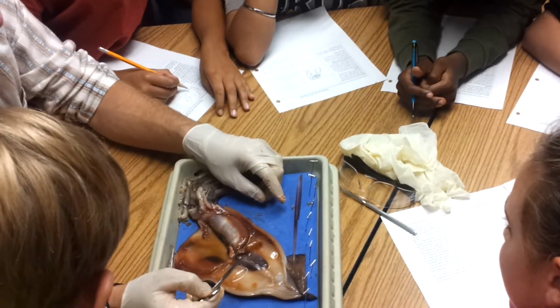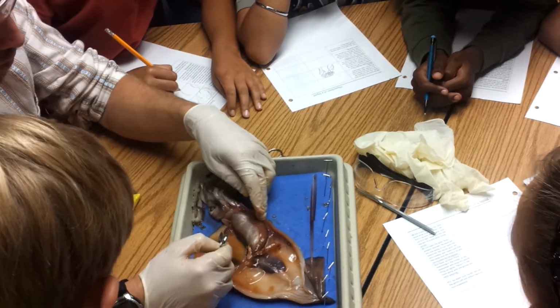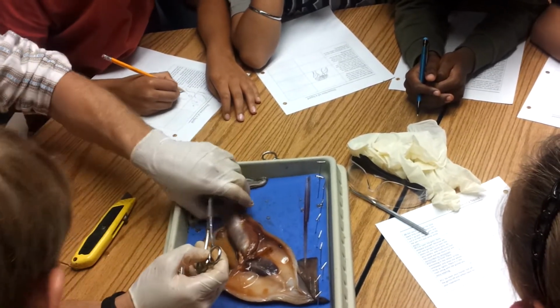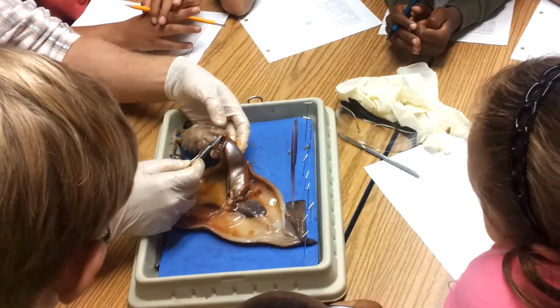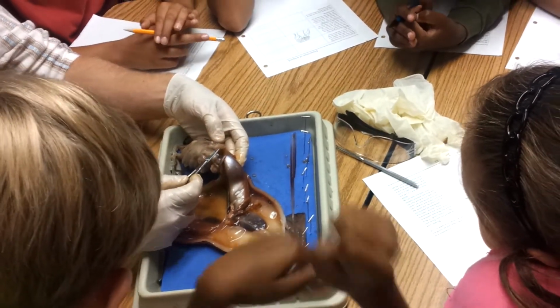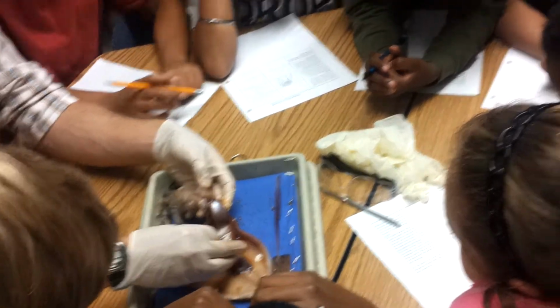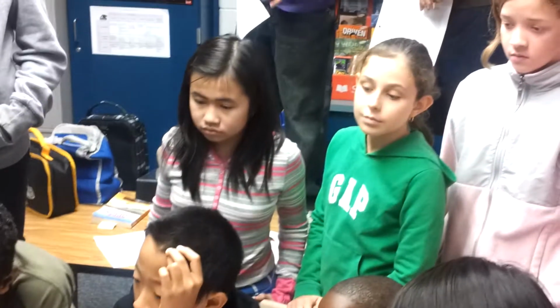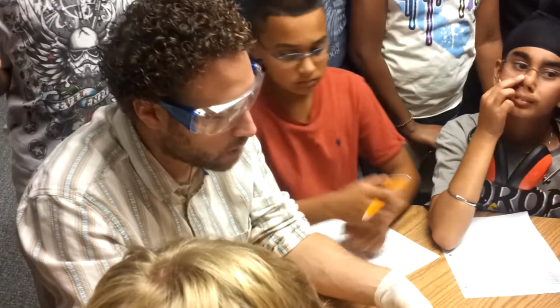Now, what else did I want to show you? Oh, okay. Now, there's another little part under here. So you see this thing right here? That's the jet. One of the ways it propels itself is it sucks water into this cavity up here and then shoots it out through this jet. It's like a jet ski. And it shoots out water, and that makes it fly through the water. Okay? Yeah, it's water propelled.